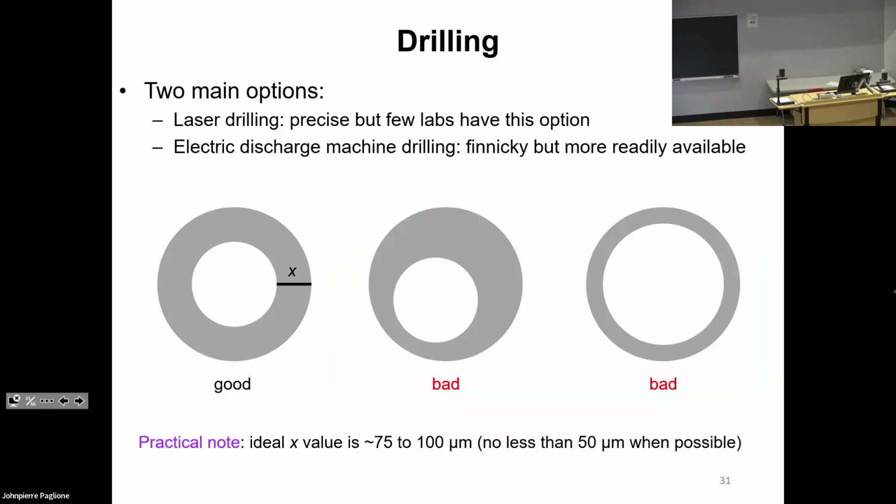And what you want is a good thickness of gasket. If we're looking at the pre-indented part of the gasket that was touching the culet, we want a good thickness of gasket to prevent rupture. When we're going up to high pressure, we don't want a thinner area here. That would be the most likely place where the gasket might rupture. So we both want it well aligned and also to have a good appreciable thickness here.